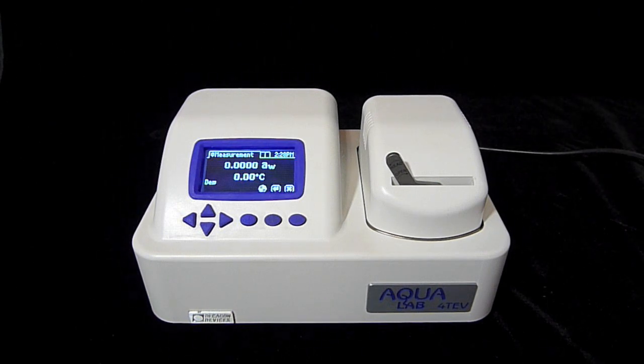After a minute or two, the Series 4 will show an initial water activity for our graham cracker sample. This reading is preliminary and will change. The Series 4 will continue to make water activity readings until successive readings show that your sample has reached equilibrium. While we're waiting for this to happen, let's take a look at how to prepare several different types of samples.